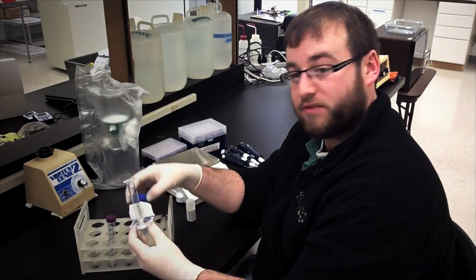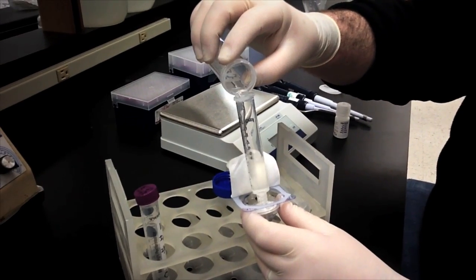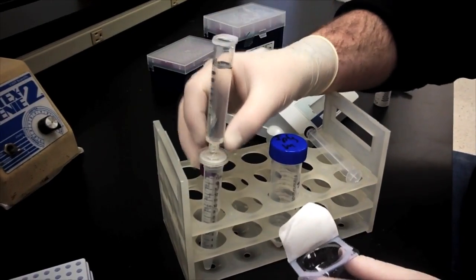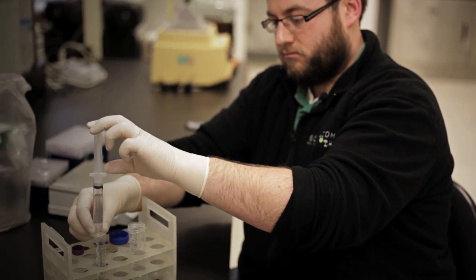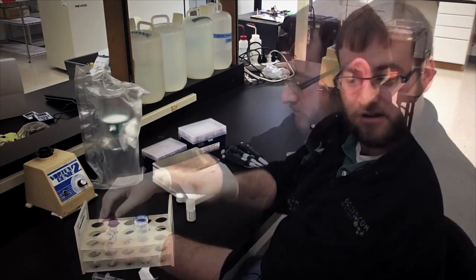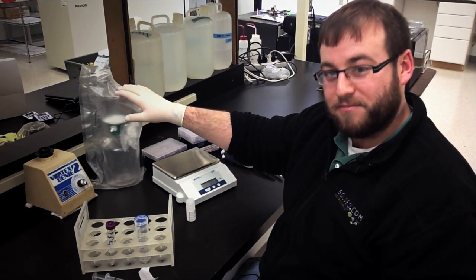A syringe filter like this one works best for smaller volumes. If you need a larger volume of solution, a vacuum filter is the best way to go.